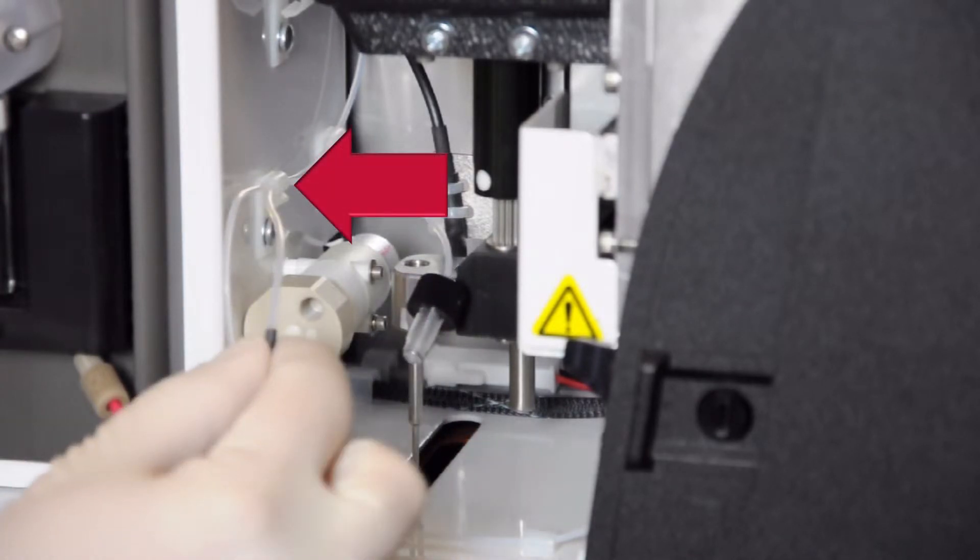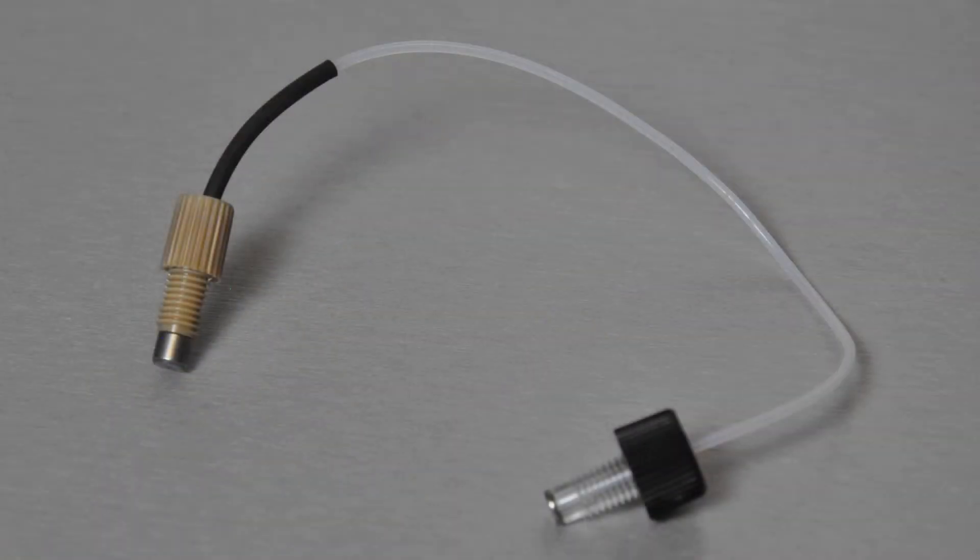Pull the loose tube through the strain relief to remove the tube. The sample probe tube is subject to wear because of the constant motion of the sample probe. Consequently, maintenance requires replacing this tube on a yearly basis.